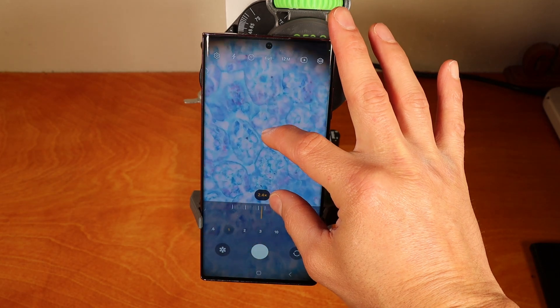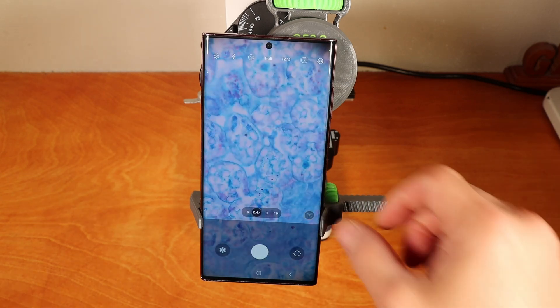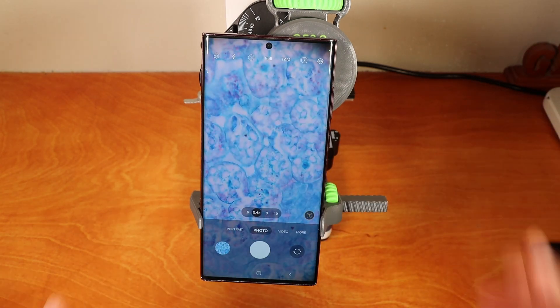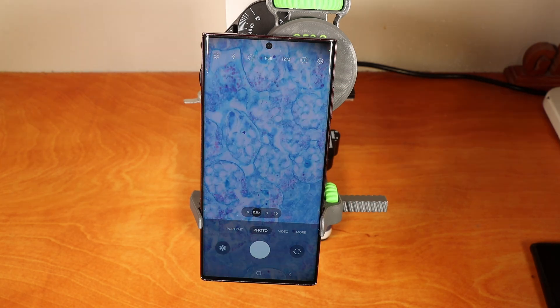At this point, I already have a beautiful image. I can use my phone to zoom in further, and then take photos and video. The setup is really straightforward and meant to be as intuitive as can be. This adapter is fully available for free download at openocular.com — no need to sign up. If you have any questions or design requests, let me know. The design can be updated at any time and re-sent out, so any changes are possible and may be incorporated in the next version.